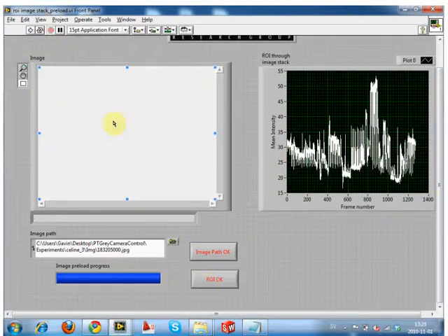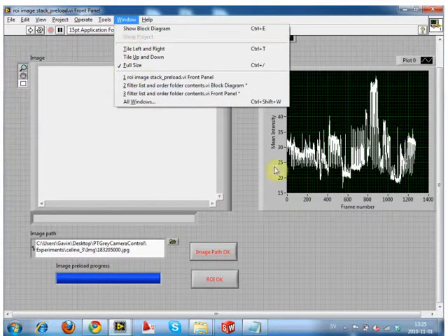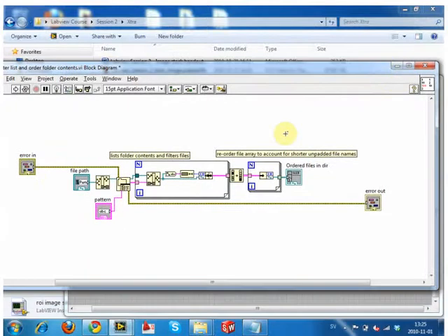We haven't stopped. I'll show you in the next data set, using the new one, what these look like when it's ordering them correctly. Okay, so first of all, we need to speed up. Enough about where the bug is in my program, and we'll look more at what we're going to do today.